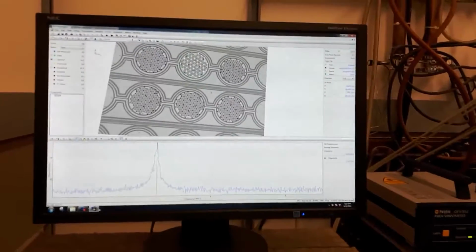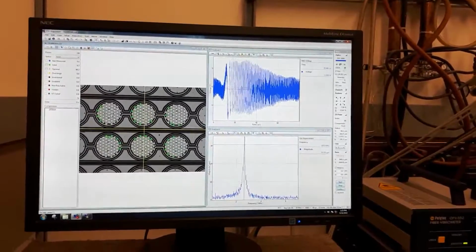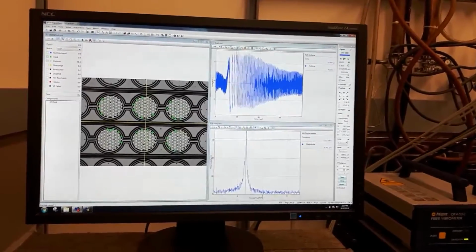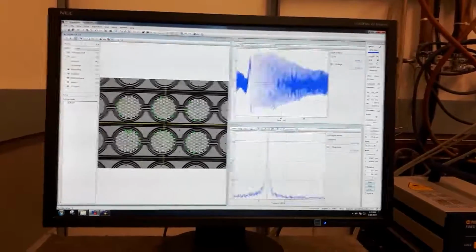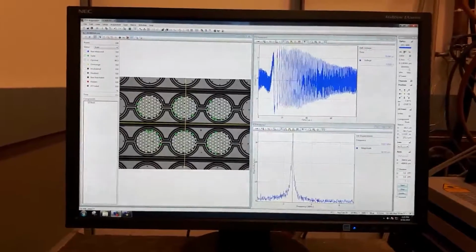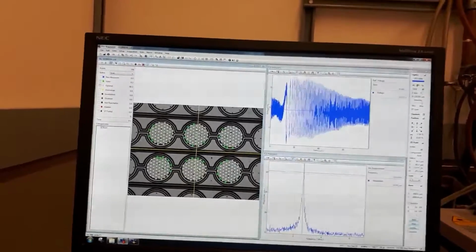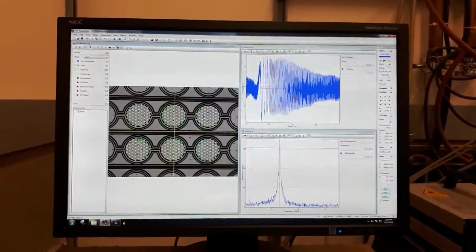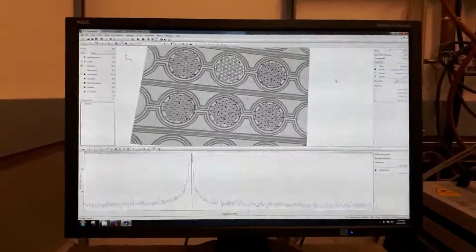Another option is going back to your measurements, and instead of having this 6 circular array, you have one point here, one point here, one point here. Or just draw a rectangle to have 6 measurement points. This is an enlarged, zoomed version. But if you have, let's say, a view of 100 cells, you can have just 100 points, and then you can measure the vibration of each one. This is basically a trick for large area transducer measurements.